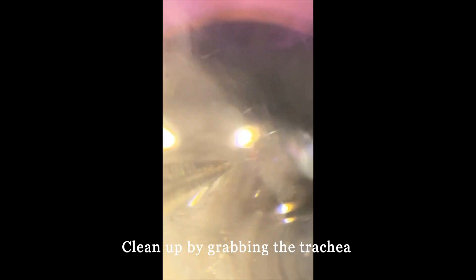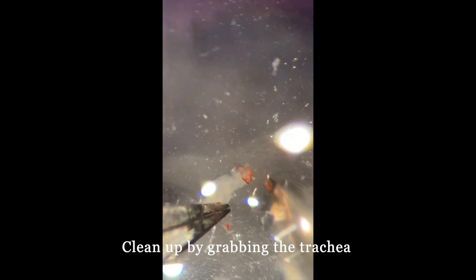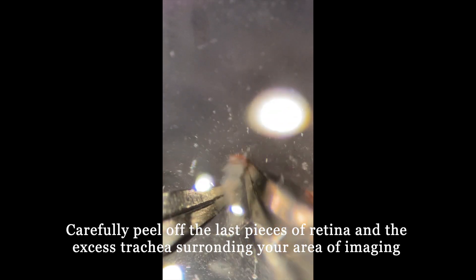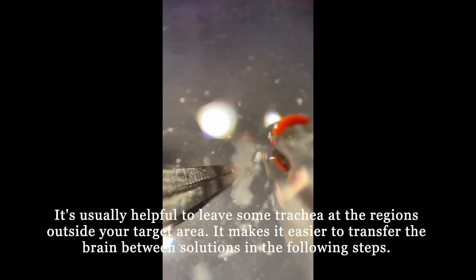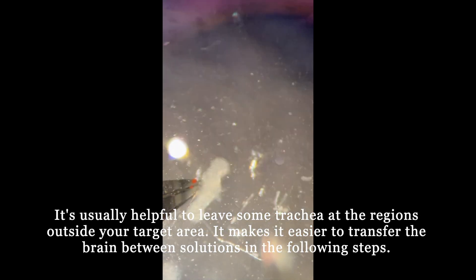For this particular brain, I have removed all of the cuticles but still have a little piece of retina on the right side. I can clean up the brain by grabbing the trachea near the center of the brain. Usually, the goal is to clean up the brain especially surrounding the area of your imaging. For example, if your target neurons are located in the optic lobes, you should clean up the optic lobes more and remove all of the trachea and retina. But you can leave some trachea at the central brain, as it makes it easier to transfer the brain.